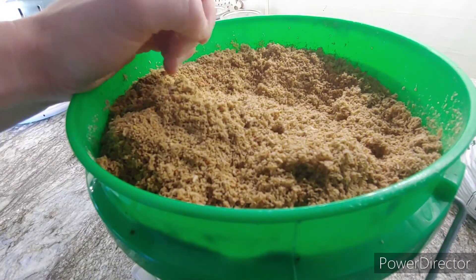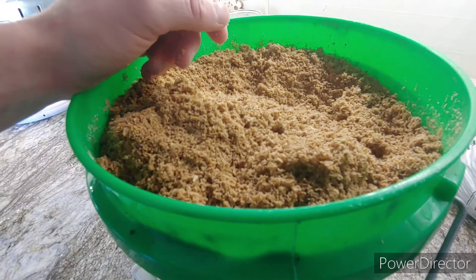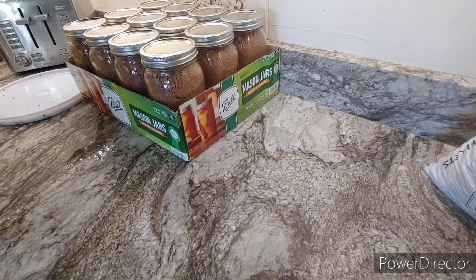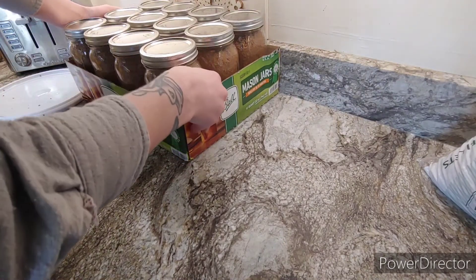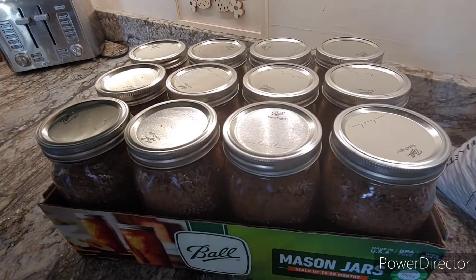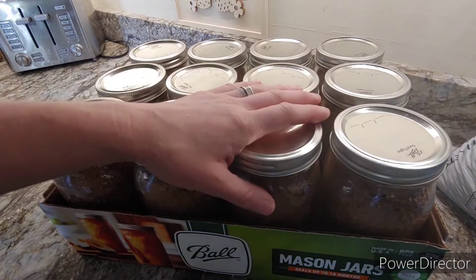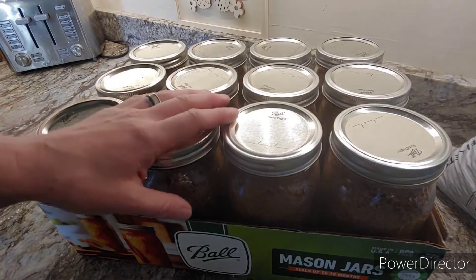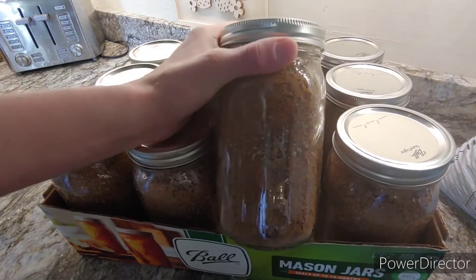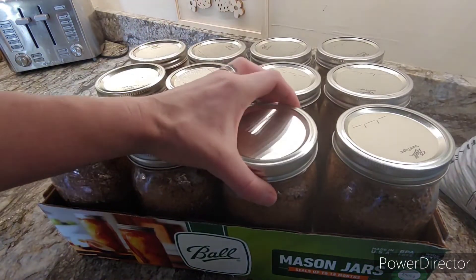I decided to use Mason jars as my containers because I wanted the ability to start reusing containers. After I had made up way too much sawdust — because I expanded three times the quantity I needed — I took a dozen of these jars and filled them up with the sawdust. Now there was a delay in time between me being able to jar these up and after they were initially pasteurized, so I actually ended up pasteurizing them again. After they were jarred, I put them into my Instant Pot pressure cooker.